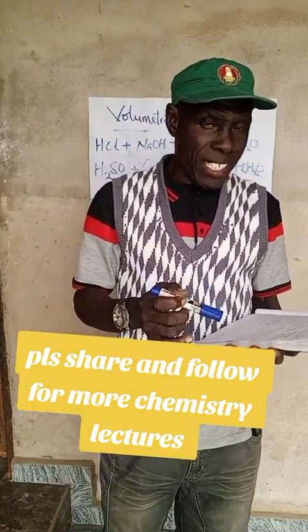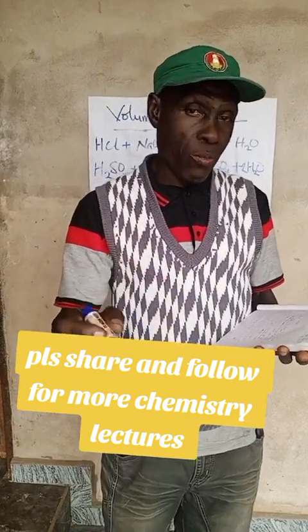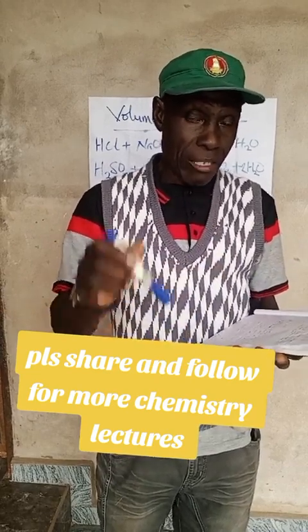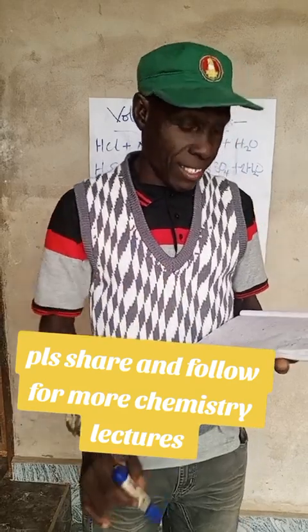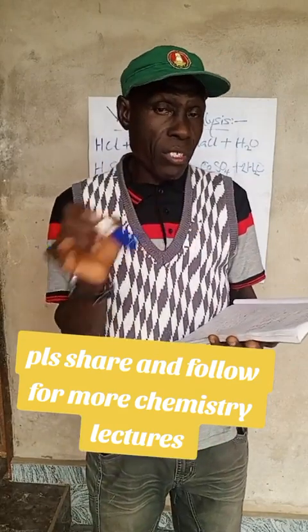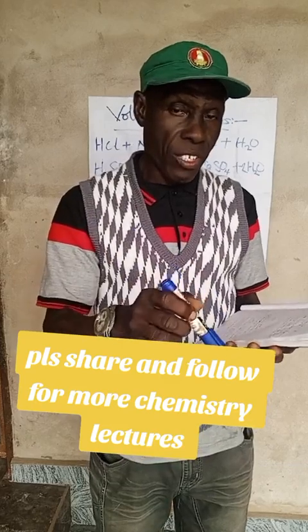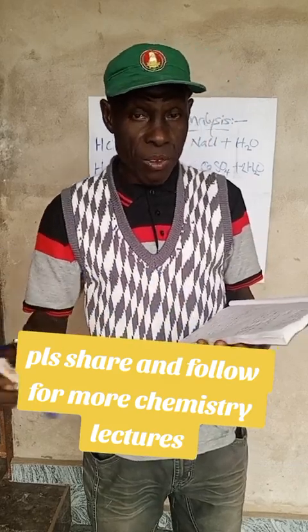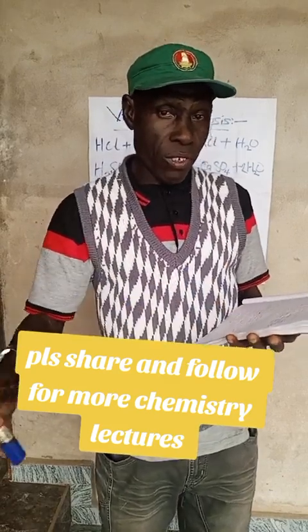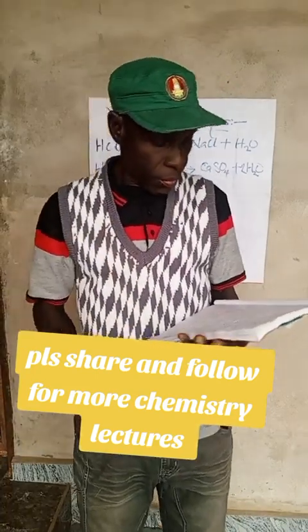Now, pipette 20 cm cube or 25 cm cube of the base, for example sodium hydroxide, and put it in a conical flask. Then put 2 or 3 drops of the indicator, methyl orange or phenolphthalein. I want to dwell on methyl orange first, then we'll go into the phenolphthalein.